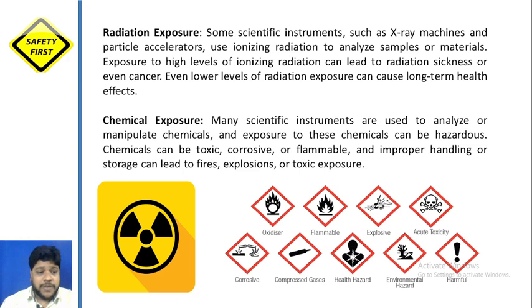Then another very common hazard is radiation exposure. In many experiments, we need high energy radiation to analyze samples and materials, but the exposure to this radiation can lead to very severe health conditions. It can even cause cancer, and low level radiation exposure can also have some long term health effects. So in the laboratories where this radiation is used for scientific analysis, the users must be very aware of the possible health hazards while working in that area.